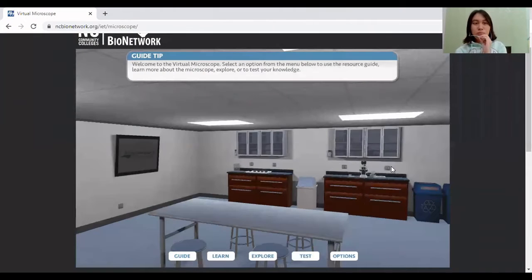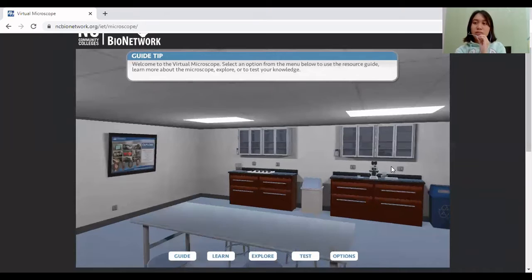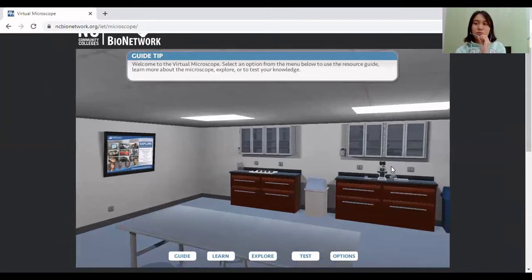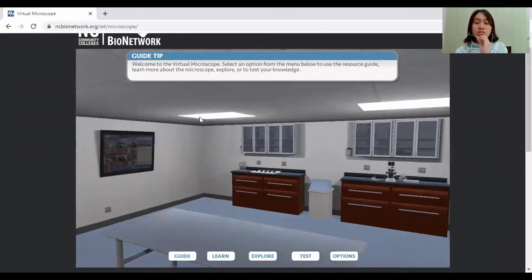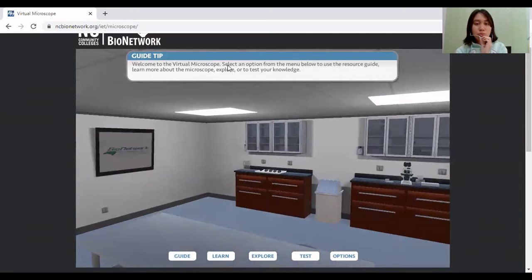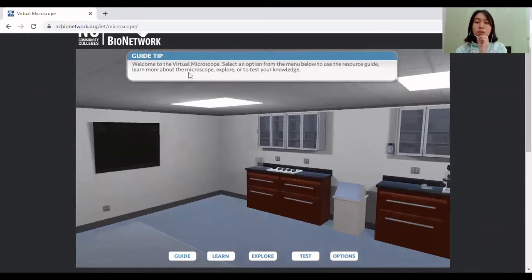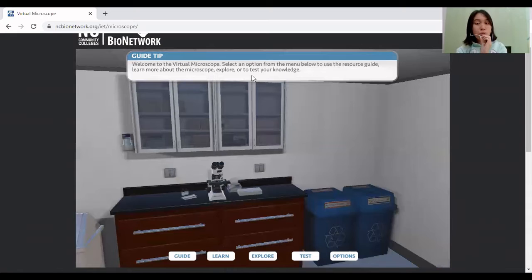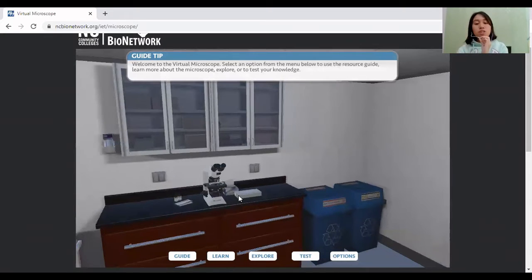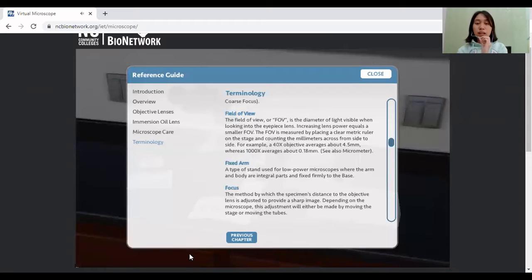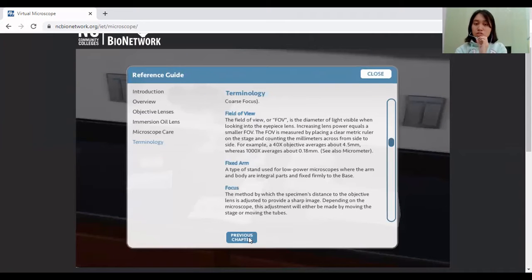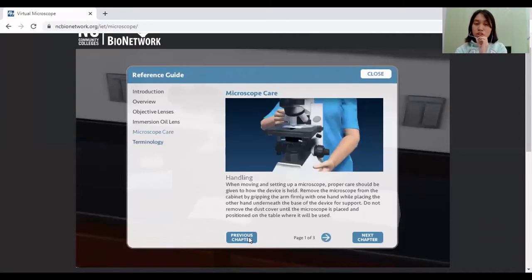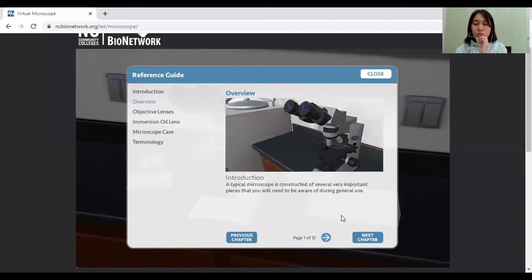Okay, so I'm now here at the website of a virtual microscope. So let's start. Welcome to the virtual microscope. Select an option from the menu below to use the resource guide and learn more about the microscope to explore and to test your knowledge. So let's first click this guide button. The guide button is a reference guide on how to use the microscope and its terminology, its care and proper handling, the parts of the lenses, the overview or the introduction of the microscope, and so on.